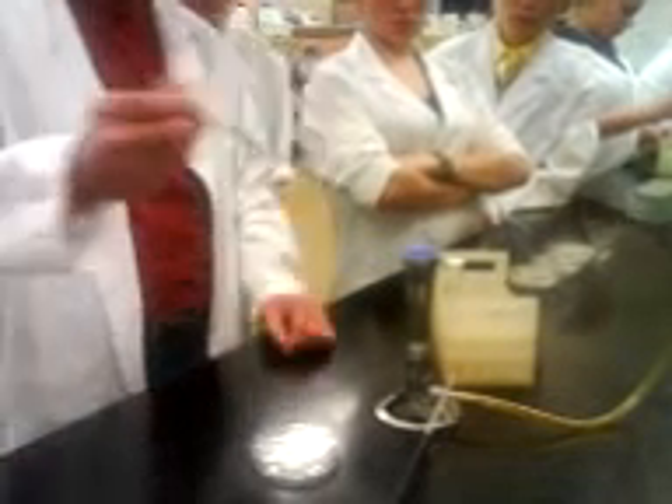Looks good. You've identified it with the culture you're going to use and got yourself sorted out here, so everything is handy. I'm right-handed, so cultures are on the left. If you're left-handed, cultures are on your right in an appropriate wrap.